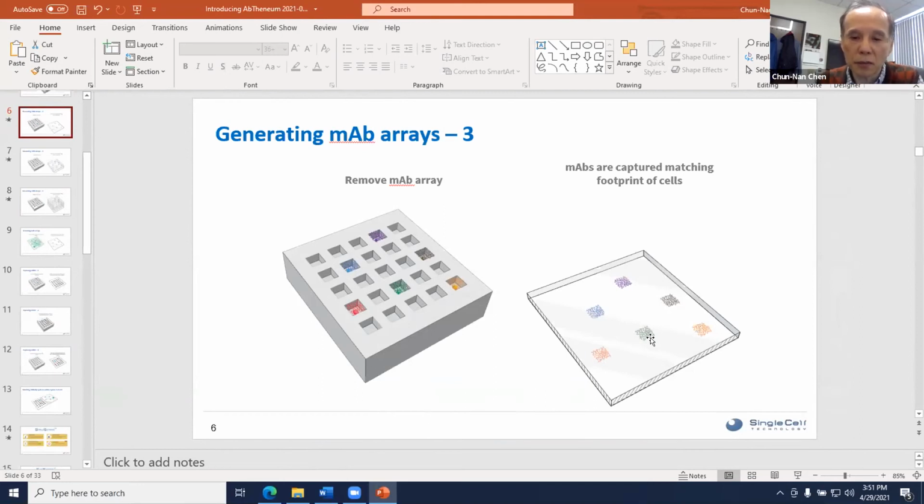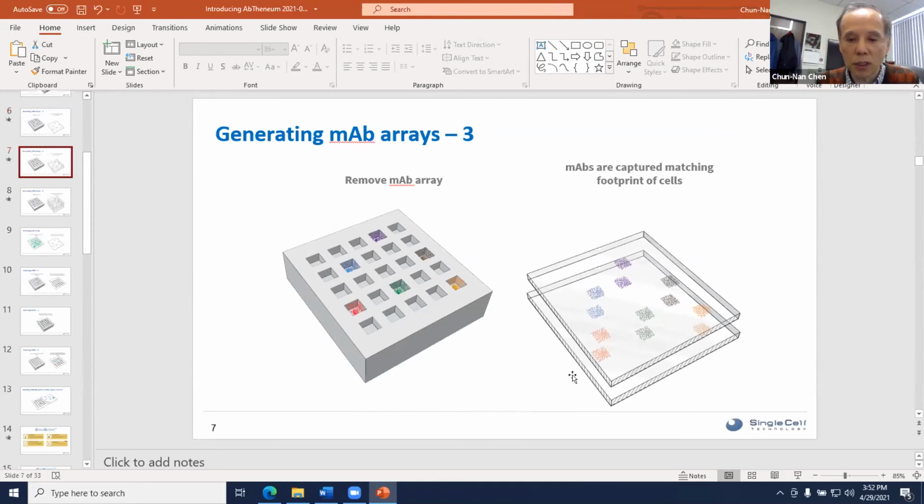So you're looking for the antibody that, when it binds to the cells, gives some sort of readout, some fluorescence that triggers the reporter gene inside the reporter cells. And that's the kind of functional assay that we'll be looking at. So the capture setup would be totally different. This is more related to the Simul screen here. We have to remember that we can use one slide to capture antibody onto the slide and interrogate it just like we do with the different fluorescent-labeled molecules.